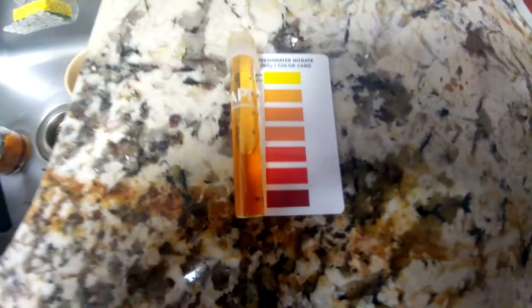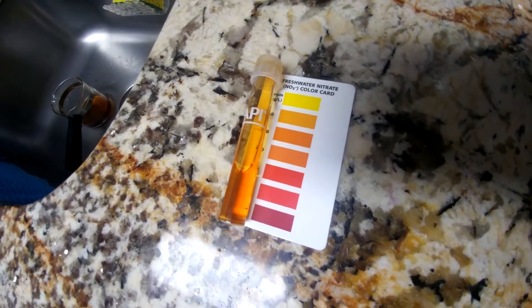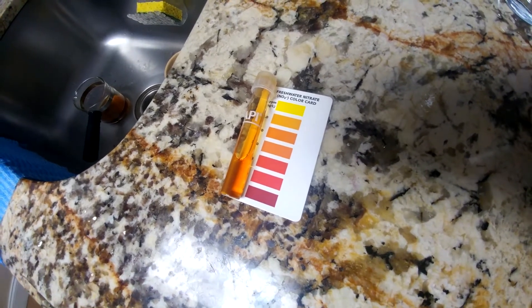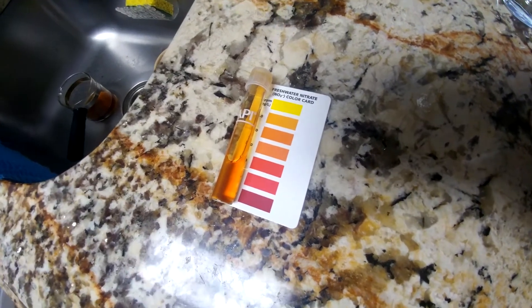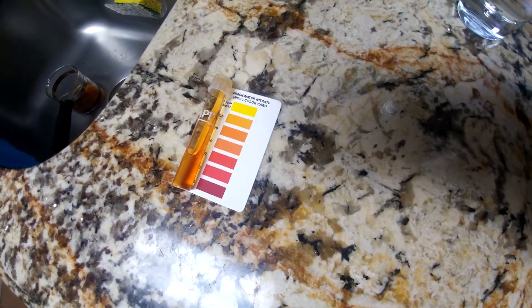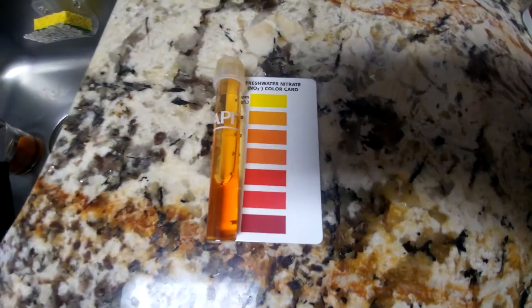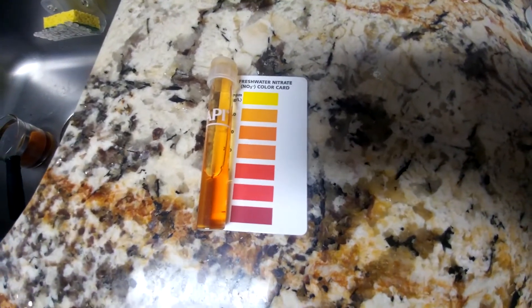Here we have the nitrate result — laying it down next to the chart, we have around 10 ppm of nitrates, which is perfectly fine. It's between 5 and 10 and only minimally toxic for the fish. This 40-gallon tank has had nitrates up to 40 ppm before. I'm going to let this tank slide for a couple more days — I normally do two water changes a week on my fry tank, so next time I do a water change I'll hit these tanks up.